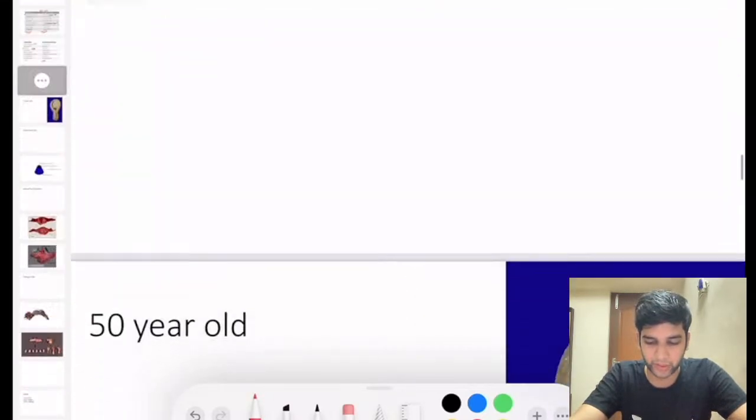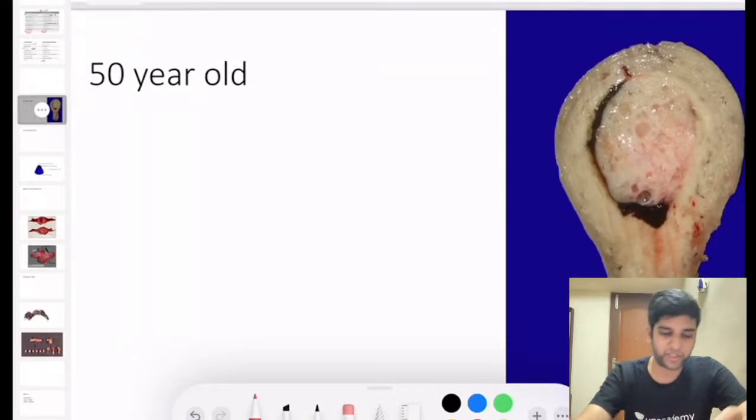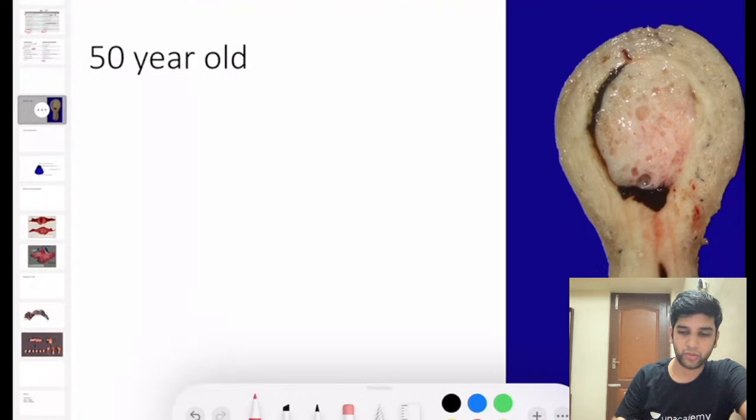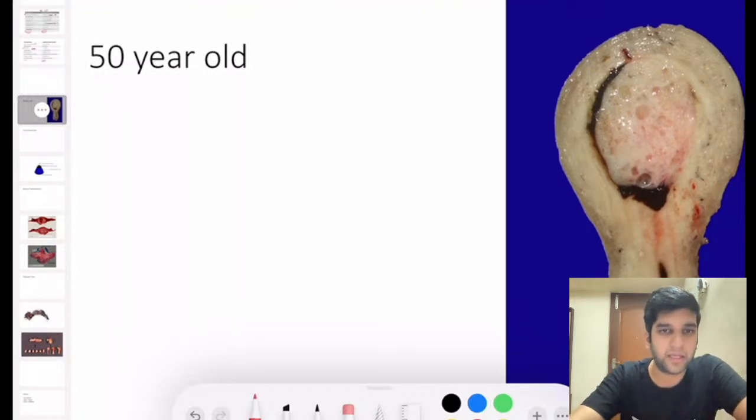Fine. Okay. So comment on your differential diagnosis. It's a 50-year-old. I'm sure you know that it's a hysterectomy specimen. So tell me your comments. I'll keep quiet for the next 30 seconds. I want you to describe the image. If you're a postgraduate, description is very, very important for gross. Describe them and then tell your probable differential diagnosis.